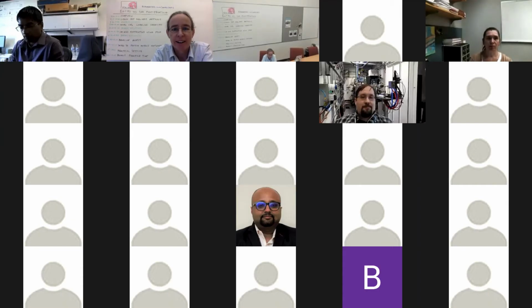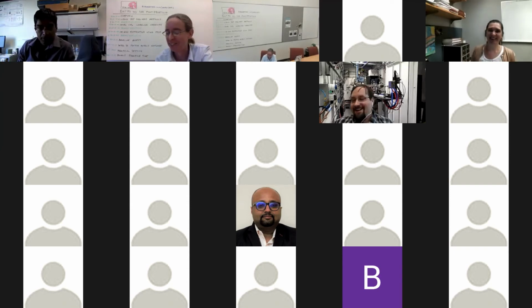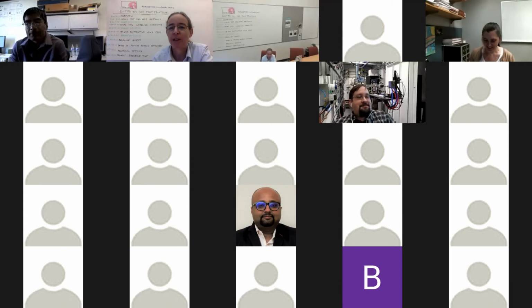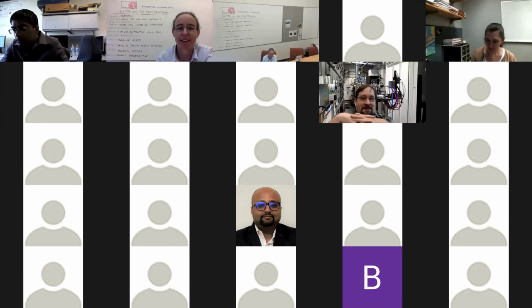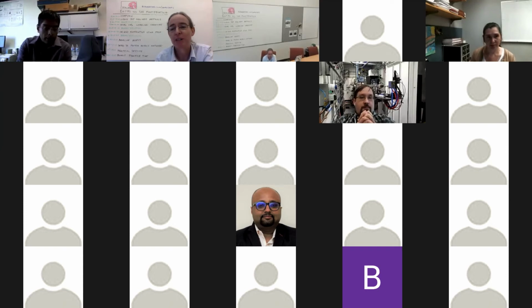Great. Thank you, Eric. Eric, I realized I forgot to introduce you. I'm really sorry. So Dr. Eric Farquhar is, as you've seen, an expert in X-ray footprinting, but I just wanted to point out he's also an expert on X-ray absorption spectroscopy. So if you have other questions about spectroscopy, you can ask him that as well. Of course, if you want to do some footprinting experiments, reach out to Eric or reach out to me, and we will help you get started on either the East Coast or the West Coast footprinting beamlines.